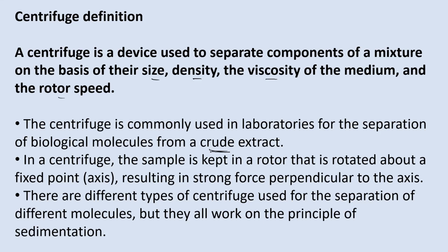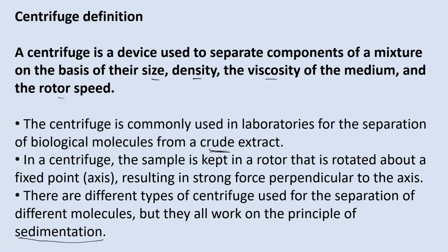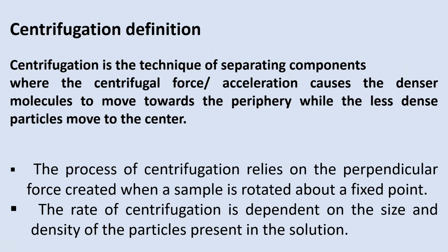There are different types of centrifuge that are used in the laboratories, in the R&D labs for separation of different molecules, but the principle is the same. The principle is sedimentation. We are using centrifugal force, we are sedimenting the biomolecules based on their size, on the density and the viscosity of the medium. The definition: it is a technique of separating. So first we saw the definition of the equipment itself. Now we are seeing the definition of the process of centrifugation.